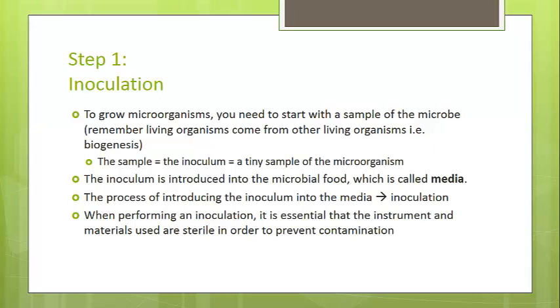You only want to grow what you have in the inoculum. And so this is really the most important first step. You're just getting that microbial culture started by taking a sample of the original culture and introducing it into media, and that process is called inoculation.